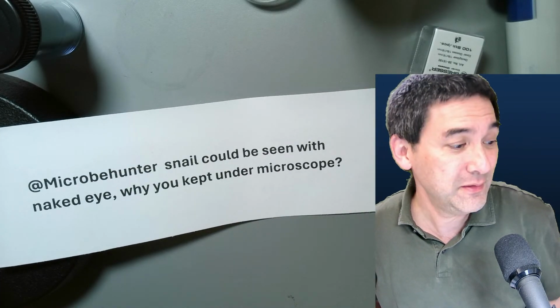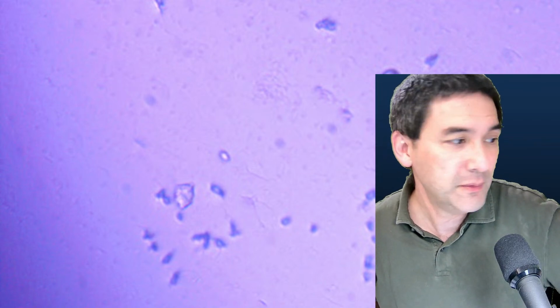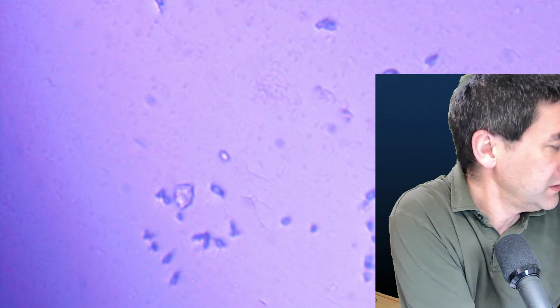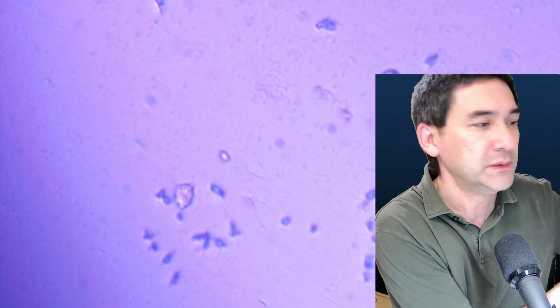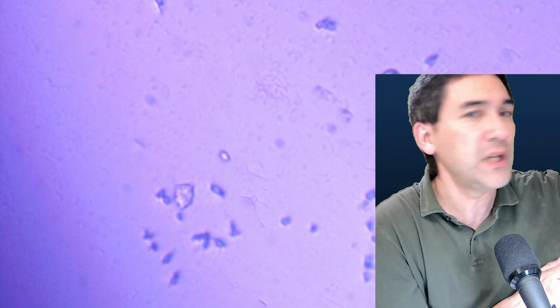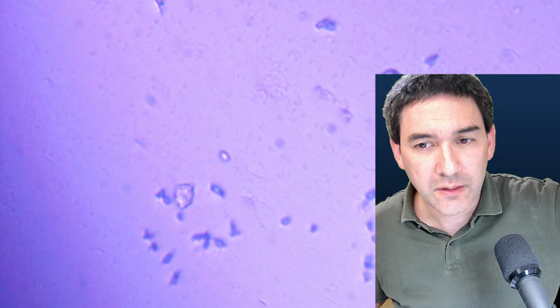And this is, no, that's not the one. Where is the camera? Let me see, I have to reattach the camera. I hope that I'm able to make this work. Just a second, I have to change the camera. Let me try this again. I hope that I'm able to reactivate the camera. Yes, we're lucky. So this is now my stereo microscope.